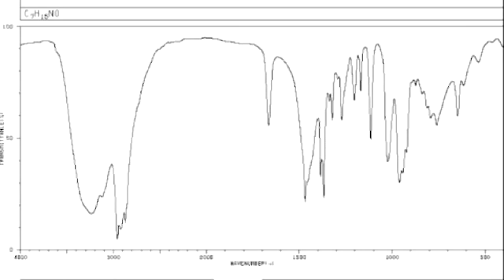So if it's neither C double bond O nor C double bond C, maybe it's C double bond N. And in fact it is. This is going to be an oxime, and we know it's an oxime for two reasons. First of all, the location and strength of that peak, and second of all, looking over at like 3300, we see a broad, strong peak that tells us alcohol, but it has that weird sort of dip in it that's not normal for an alcohol. So I'm going to go ahead and assume that this molecule contains a C double bond N single bond OH.